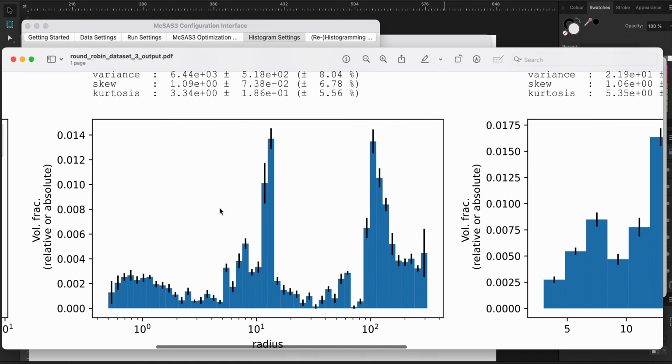The total size distribution shows 3 populations, actually, something small. That is probably the cause for this sort of slow upturn or background or whatever. That usually ends up at small sizes. We then have a population in the middle. Those are our small particles, and then we have a population a decade above that.